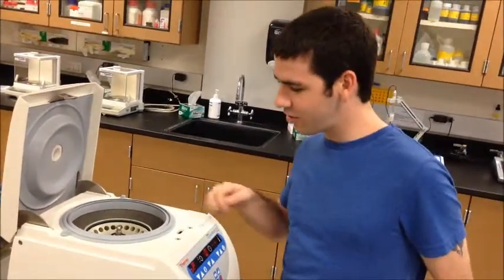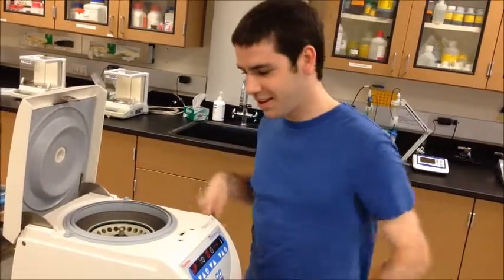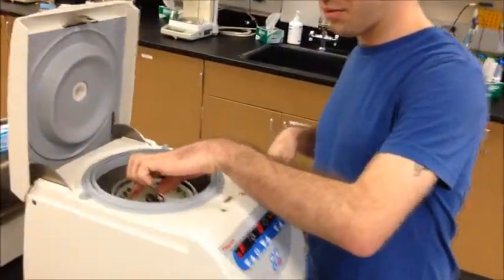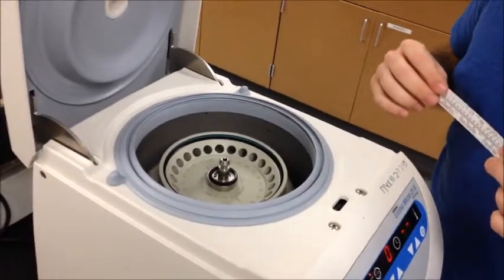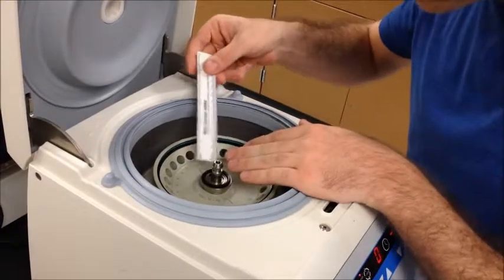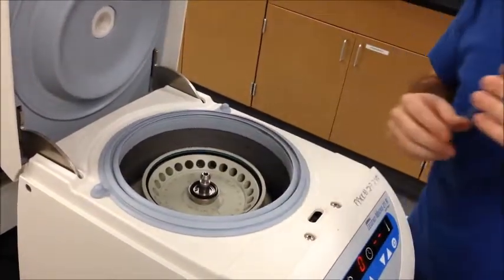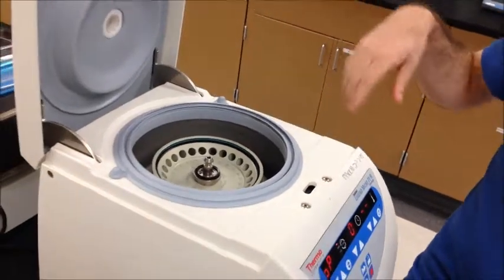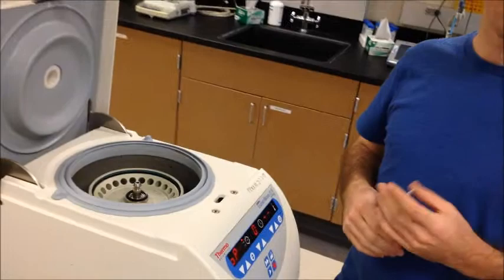So I'm imagining this being the Gravitron. Each spot in here would be a person in there. And the radius, in this case, would be about six centimeters. As it spins, more force is exerted on the bigger particles.